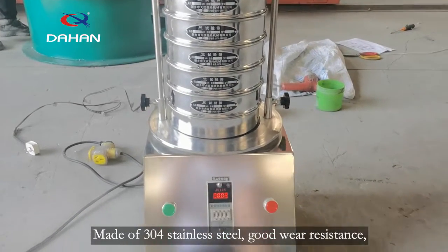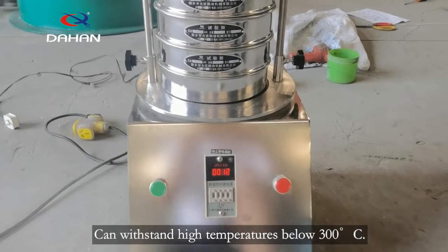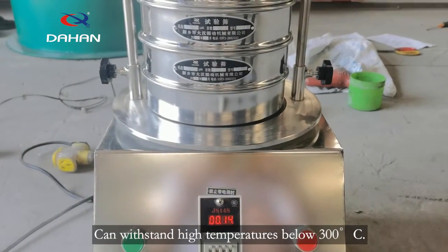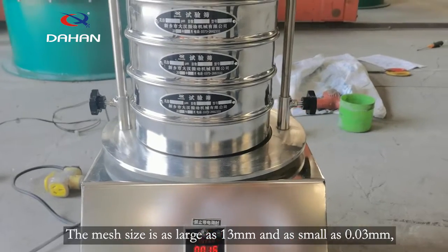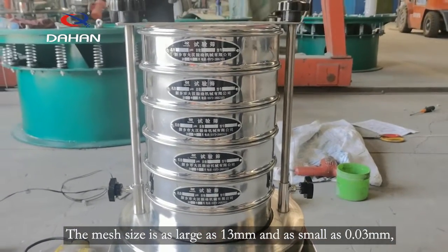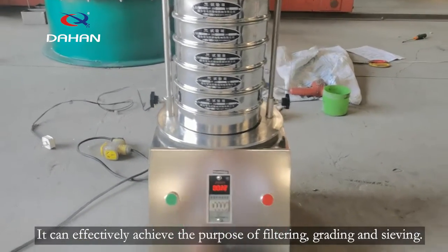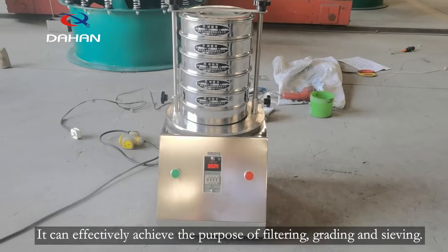Made of 304 stainless steel, it has good wear resistance and can withstand high temperatures below 300°C. The mesh size ranges from as large as 13mm to as small as 0.03mm, and can effectively achieve the purposes of filtering, grading, and sieving.